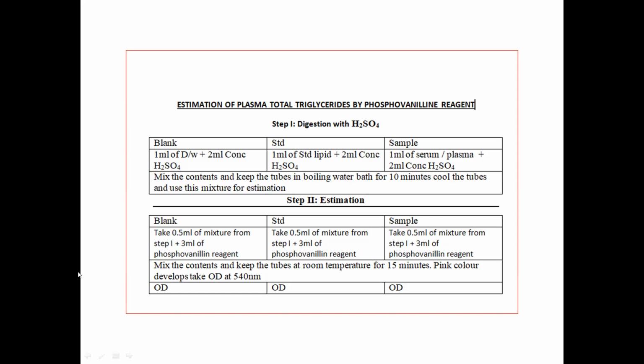Now, thoroughly mix this content. Be very careful while using it and keep the tubes in the boiling water bath for 10 minutes. Now, students, whenever you are keeping the test tubes into the boiling water bath, make sure that, who's this?